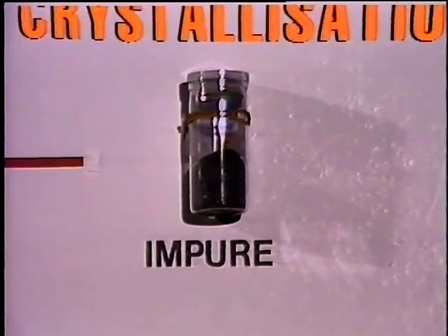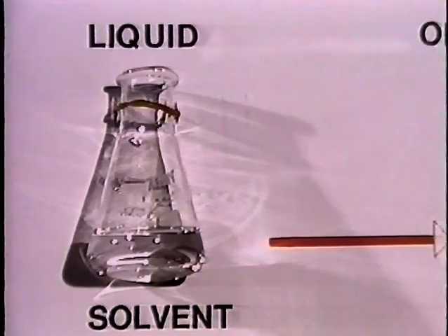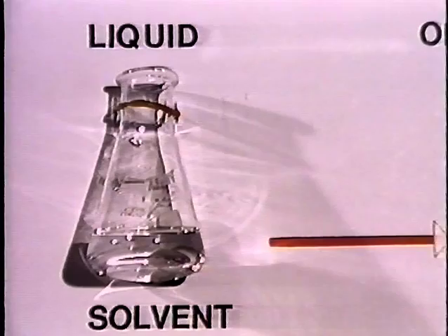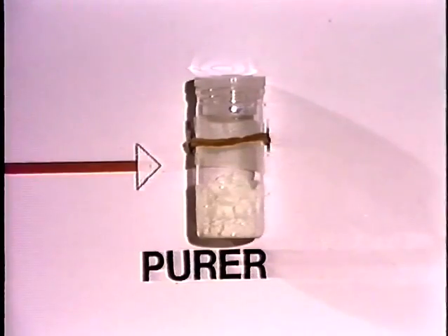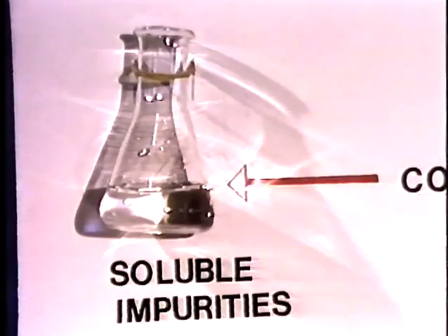Recrystallization is a means of purifying a solid. It relies on a difference in the solubilities of that solid and any impurities in it in a solvent or a mixture of solvents. The aim of this process is to separate the purer solid in a crystalline form from insoluble impurities, which are filtered off, and from other impurities which will remain in solution.